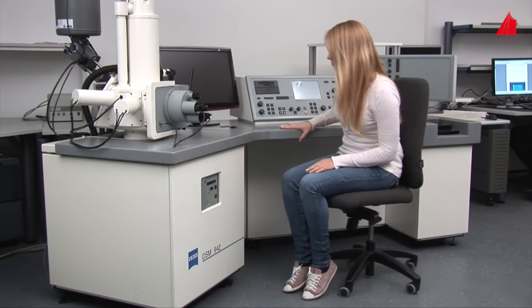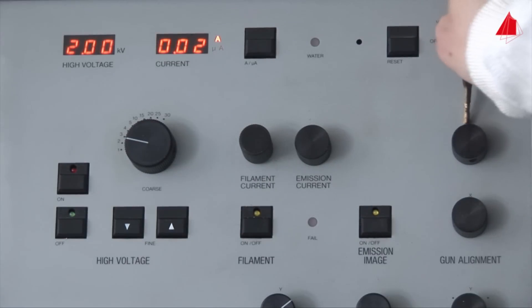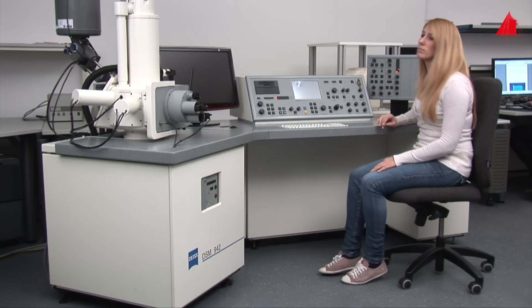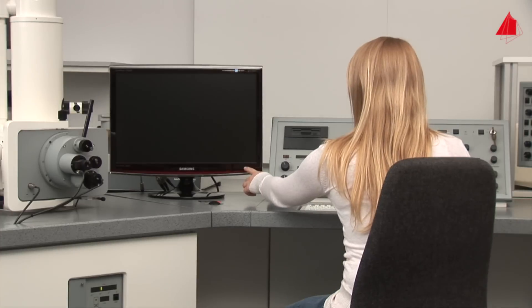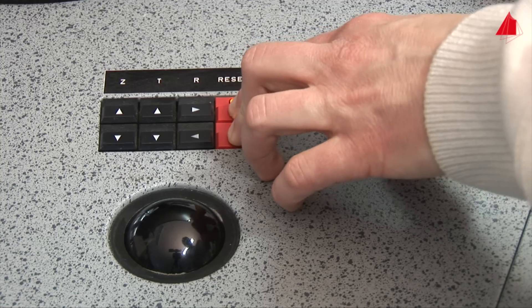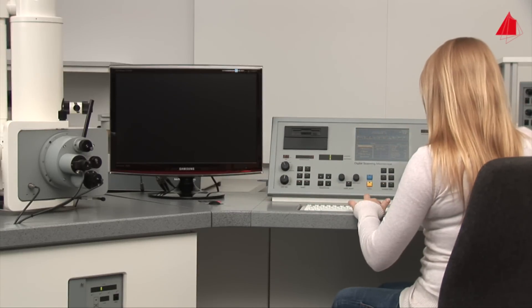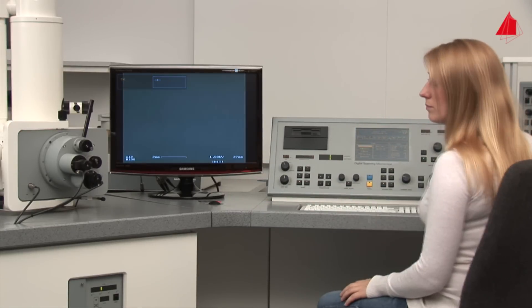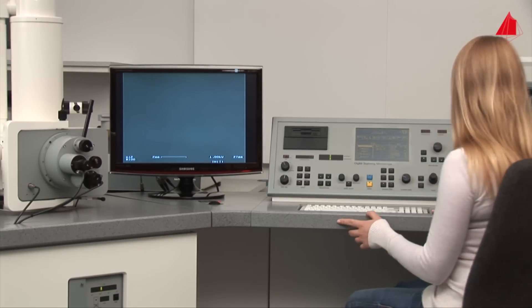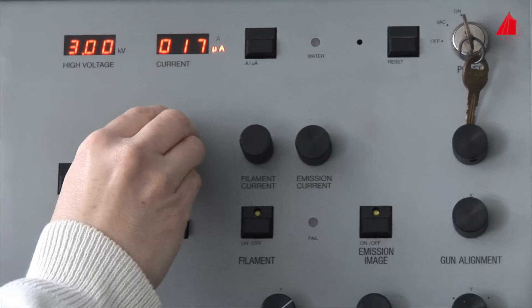It takes about three minutes to obtain a sufficient vacuum in the specimen chamber and column. Meanwhile, she turns on the monitor, initializes the motorized stage, and boots the microscope control. Only now is she allowed to switch on the high voltage and the thermionic cathode.